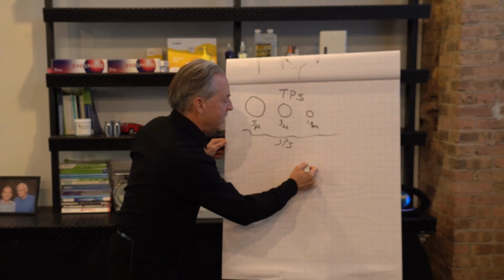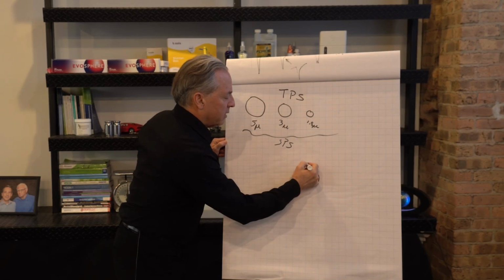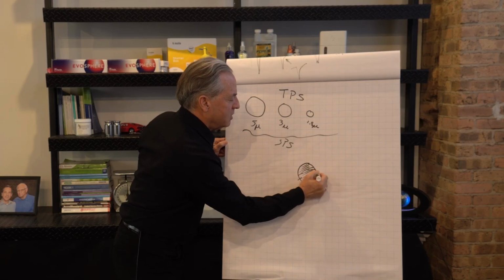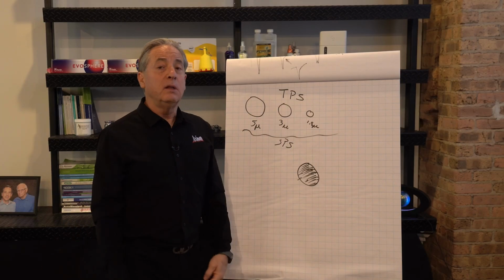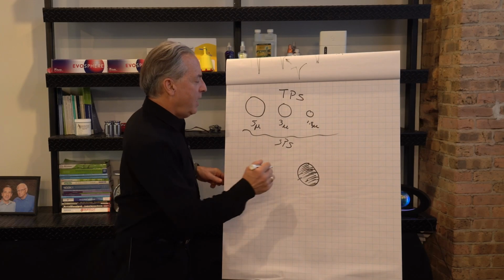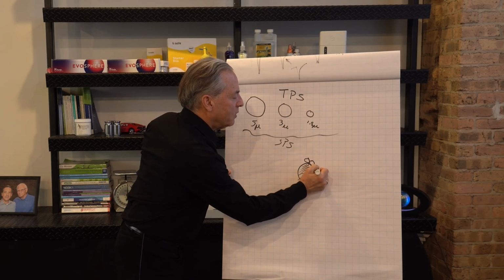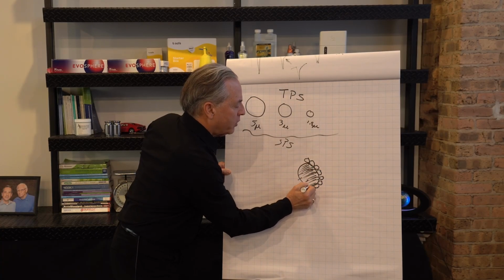So the idea is we're going to start with a solid material. I don't know how to draw solid. This is solid. It's like a glass marble. There's no surface on the inside. It's hard. In the old days, we called this pellicular material, which means the inside is non-porous. There's no chemistry going on down there. But we're going to put on a bunch of tiny little particles, and these tiny particles are totally porous.